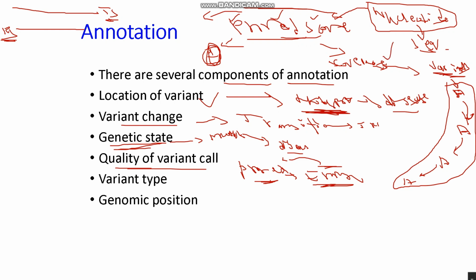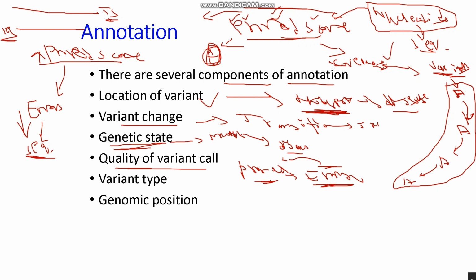By this we give the Phred score. If the Phred score is high, the error in the sequence is very low. Hope you understand it. Yes, thank you.